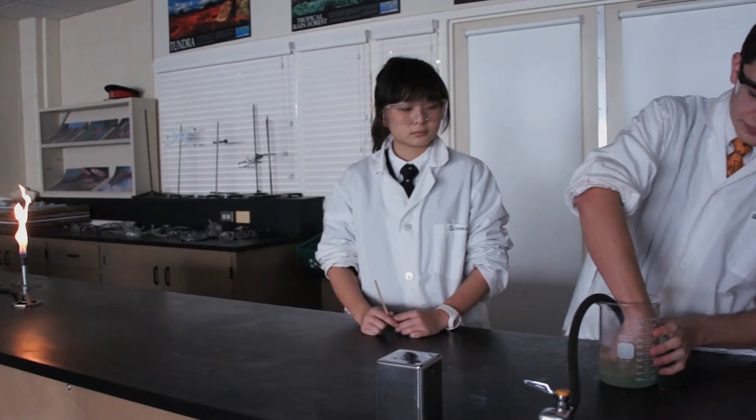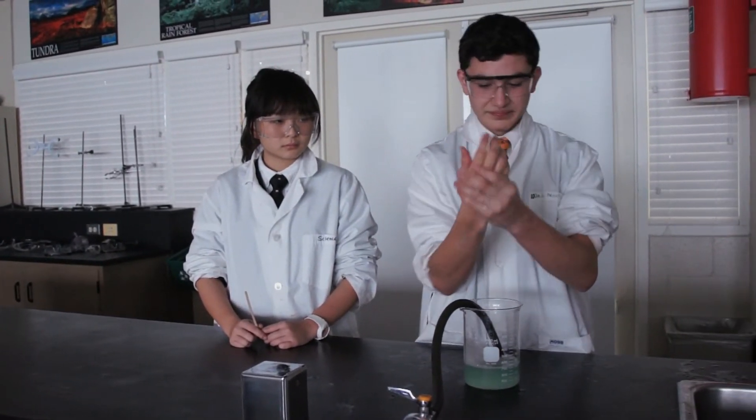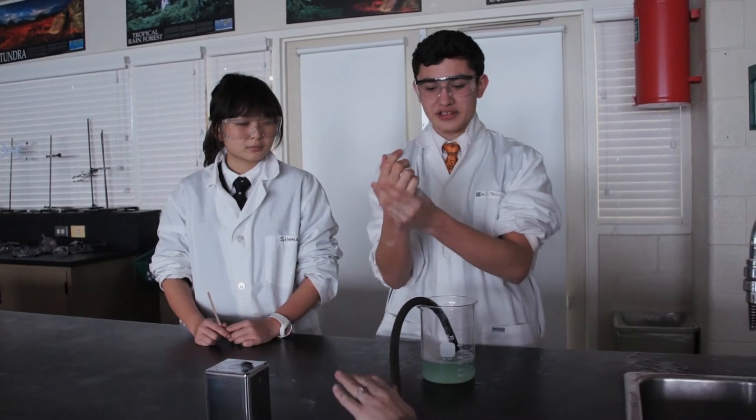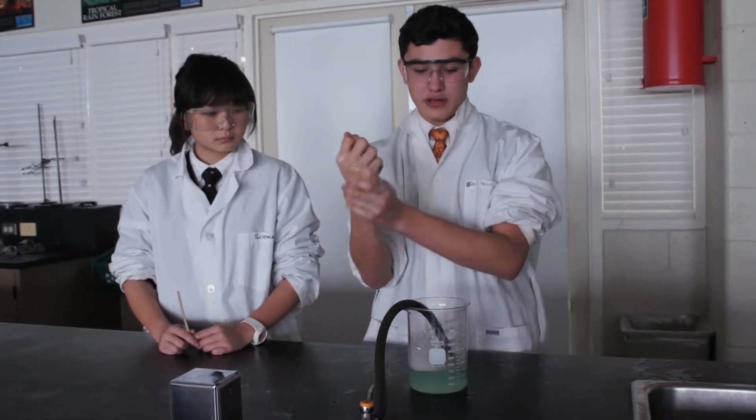So first off, I need to put my hand with soap to protect it like a coat. And secondly, we're going to turn on the gas and make bubbles, creating bubbles that are filled with methane gas.